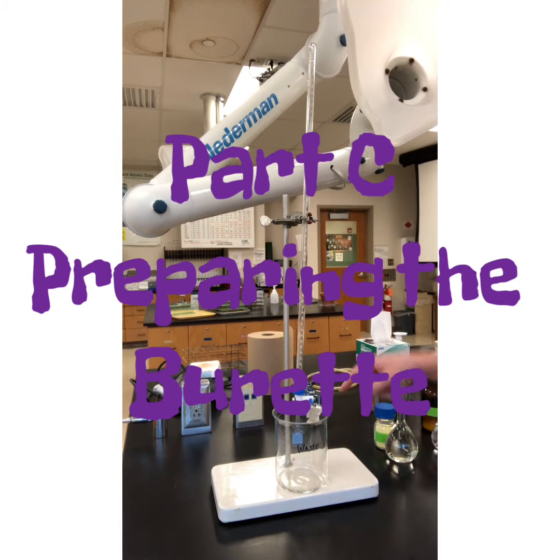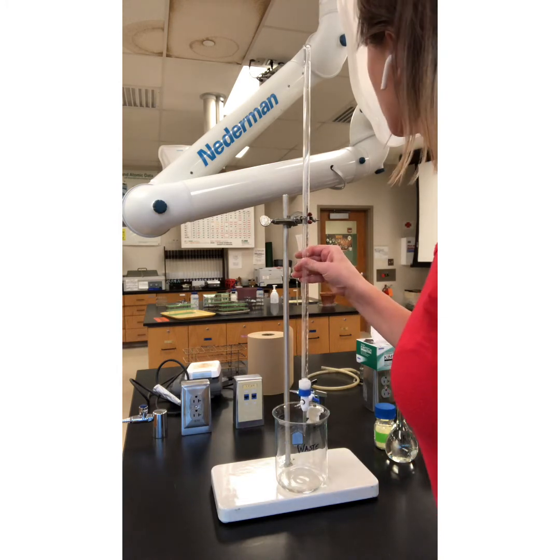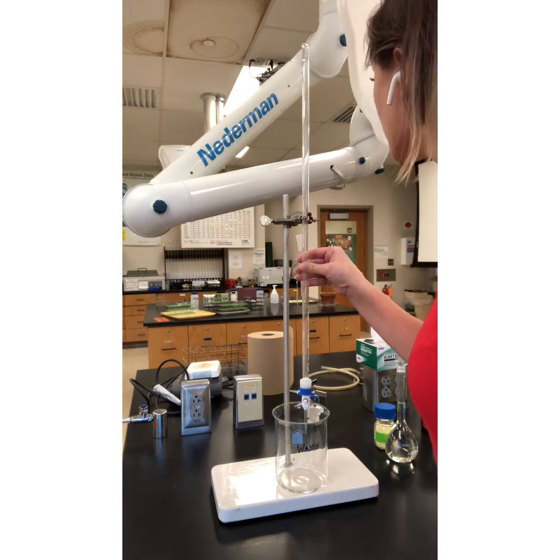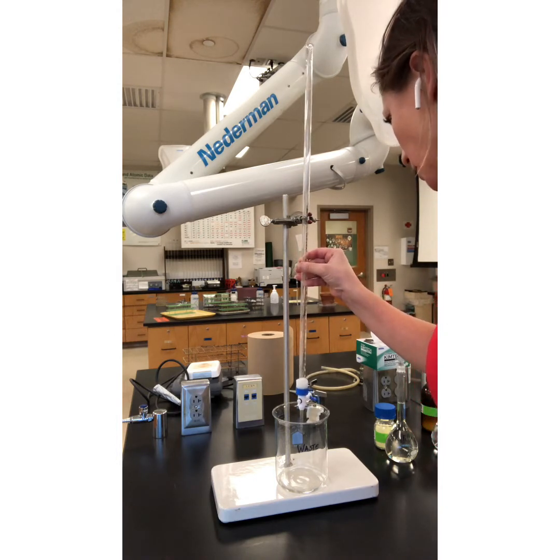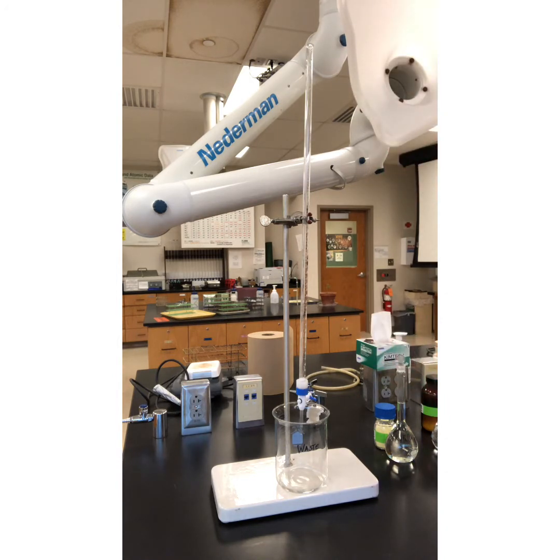So our burette is this piece of glass right here, and it holds up to 50 milliliters, and it has markings on it. It will give us lots of nice significant figures. So we have markings to every 10th of a milliliter, so we can estimate to the 100th place. That's where our significant figures will come from.